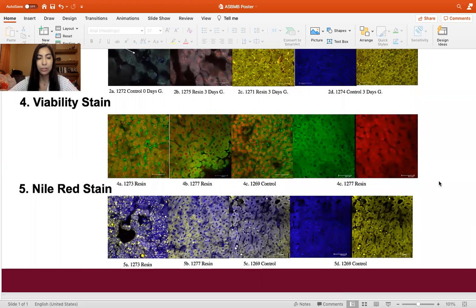The last stain that we used is a Nile red stain, which was another stain that's very useful and one that we will be using in the future as it provided lots of contrast. We were able to readily see the nuclei and the cytoplasm. This is very useful in the future as it'll help us when we're measuring how big the nuclei are when comparing the nuclei from a control and creosote diet.